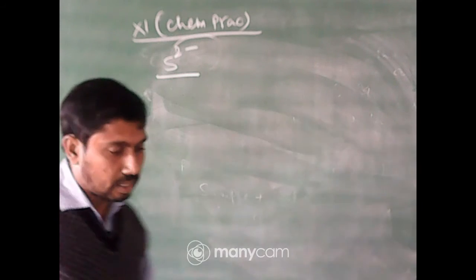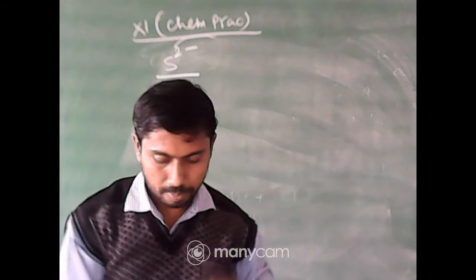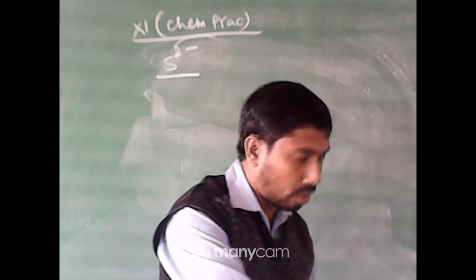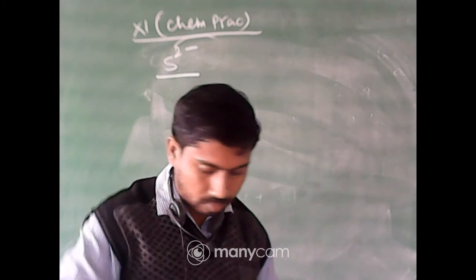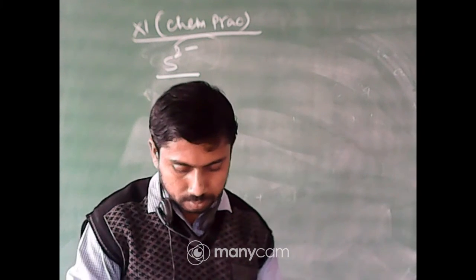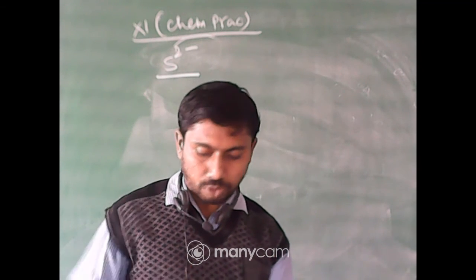Now the reagents used for the test of sulphide, the sulphide sample is here. So I am taking the sulphide sample in a test tube. These are in pellet form.